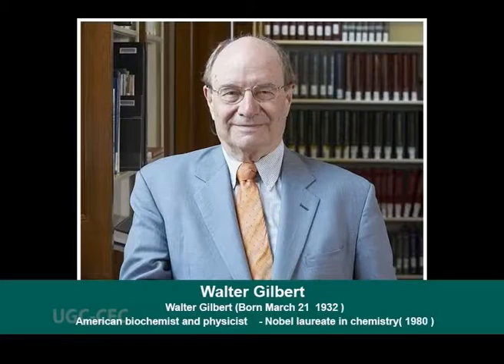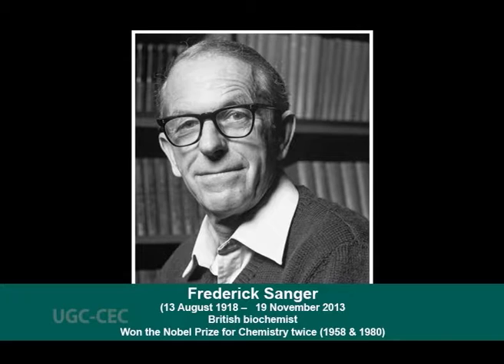In 1973, Walter Gilbert and Allan Maxam reported the sequence of 24 base pairs using a method known as wandering spot analysis at Harvard. In 1977, Frederick Sanger developed a sequencing method at the MRC Center, Cambridge.